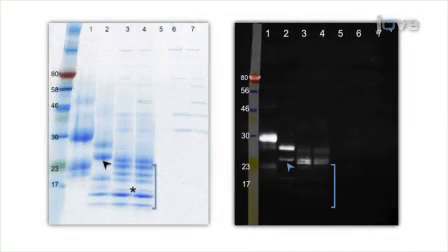Next, SDS-PAGE, followed by Coomassie blue staining and a sugar-specific staining method, ProQ Emerald 300, are used in order to analyze the deglycosylated HCG beta sample. Results are obtained which show that HCG beta is heterogeneously glycosylated and contains multiple glycoforms, based on the differences in protein migration with and without glycosidase treatment and the diminished signal on ProQ staining as the glycans are successively removed.